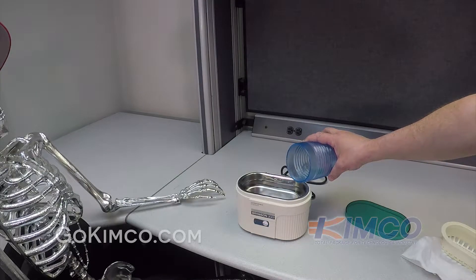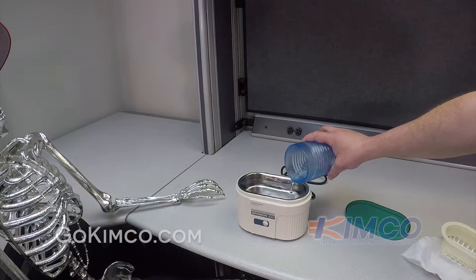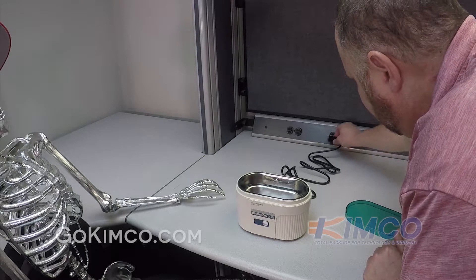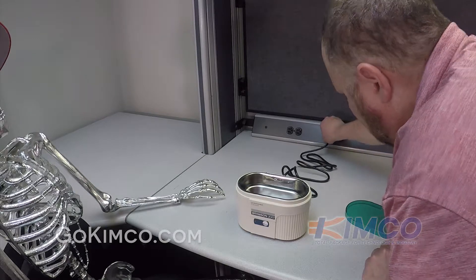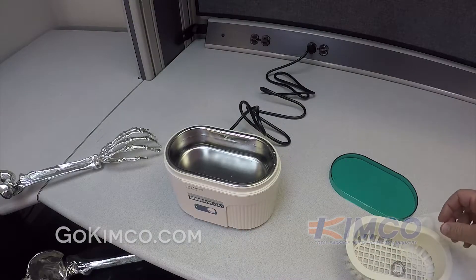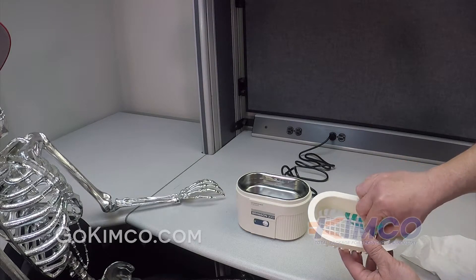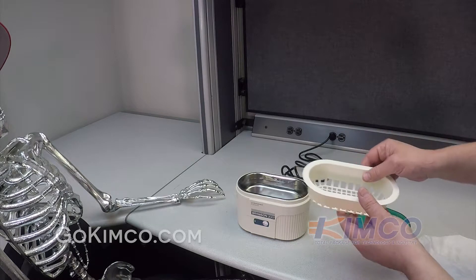So after we filled this up to about 70 to 80% capacity, we want to go ahead and plug it in and then turn it on. Give it about two minutes to allow that to mix up and de-gas, and then at that point you'll be able to add whatever you have that needs to be cleaned into the solution.